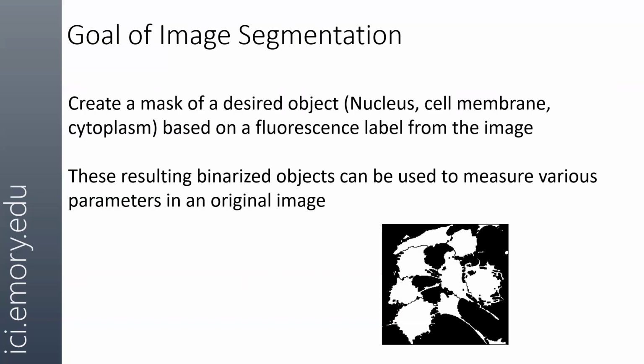From that process, we can extract things like masks, which I talked about a little before. A mask is essentially just an outline of areas of signal in the image. You can see below, we have masked the cytoplasm of a very convoluted, geometrically complex cell. Now, that doesn't necessarily mean there aren't any structures inside the mask for us to look at, but as a first approach, this removes sections of the image where there's nothing of interest going on. And that's helpful, one, because it saves us time, and two, because it gets rid of noise that could complicate our analysis at the end.